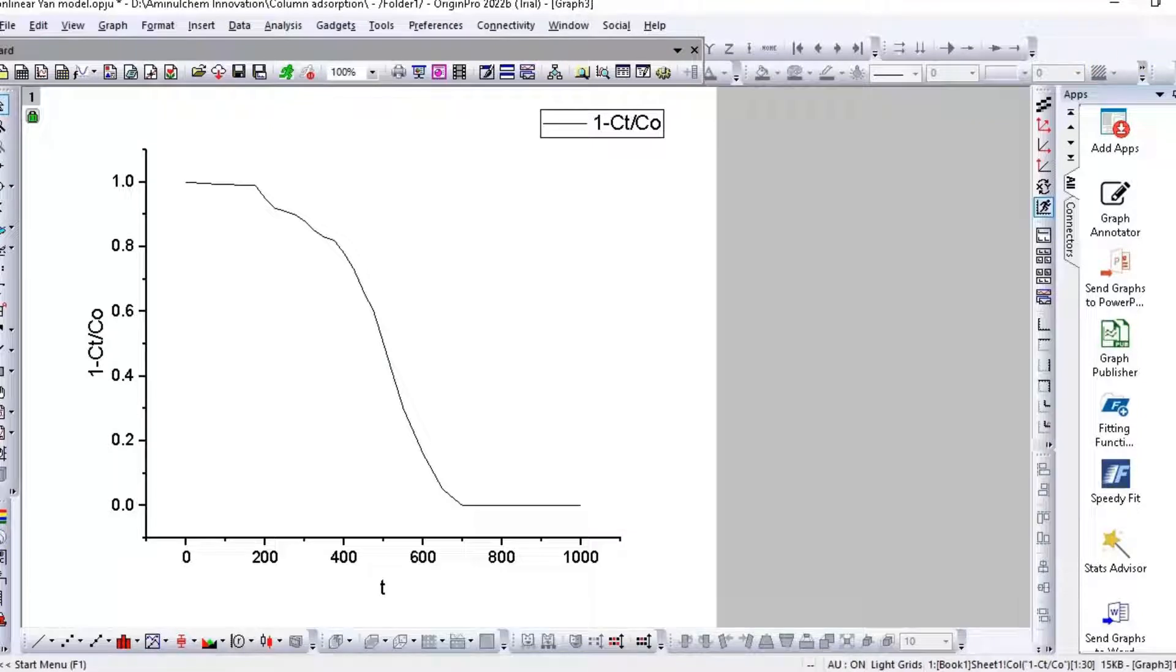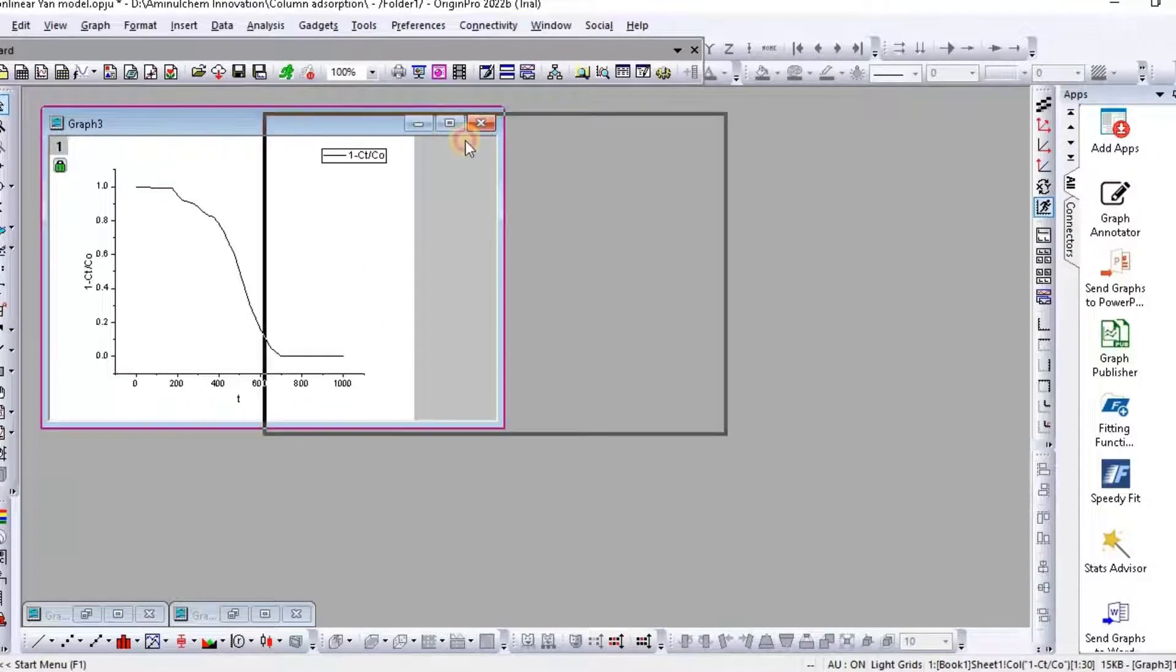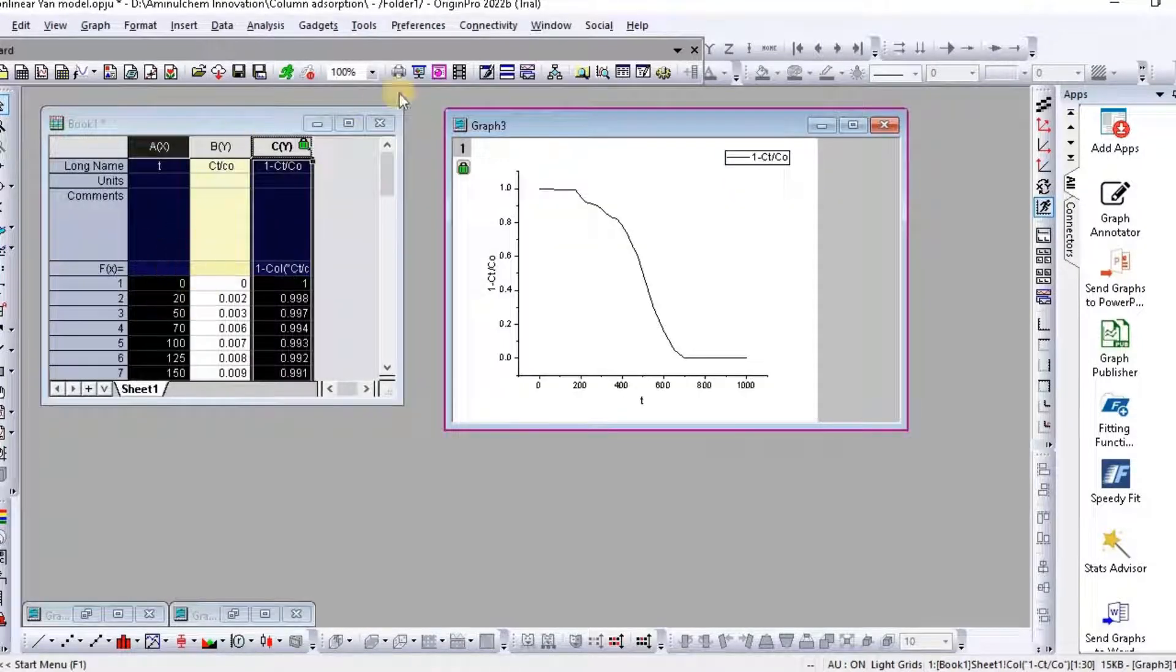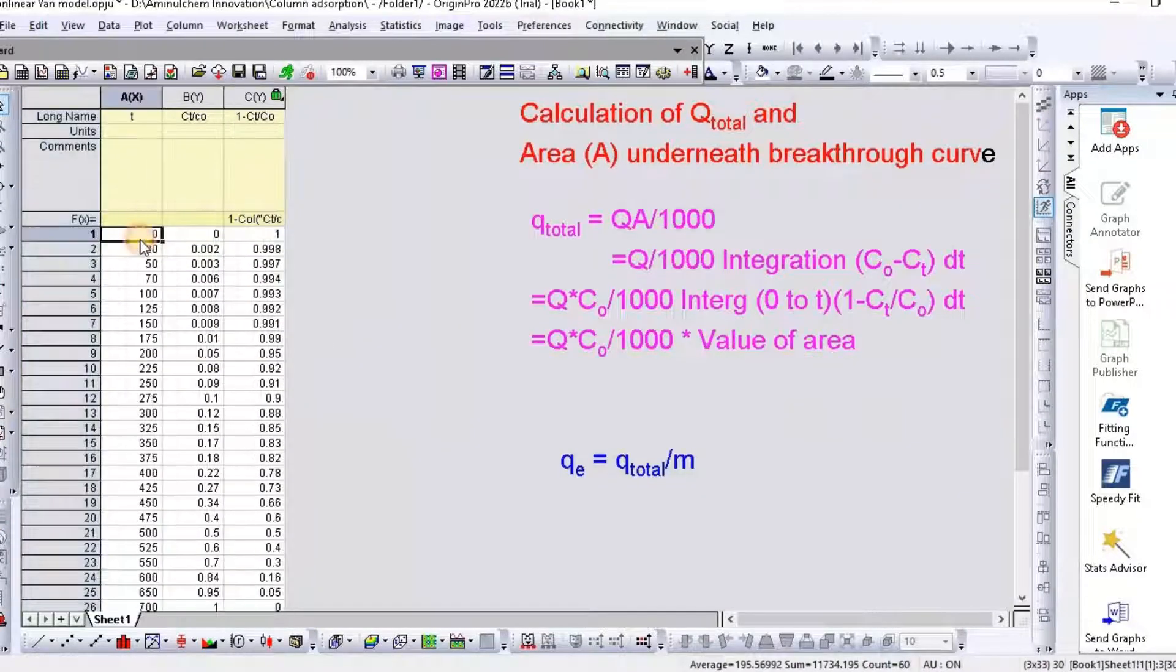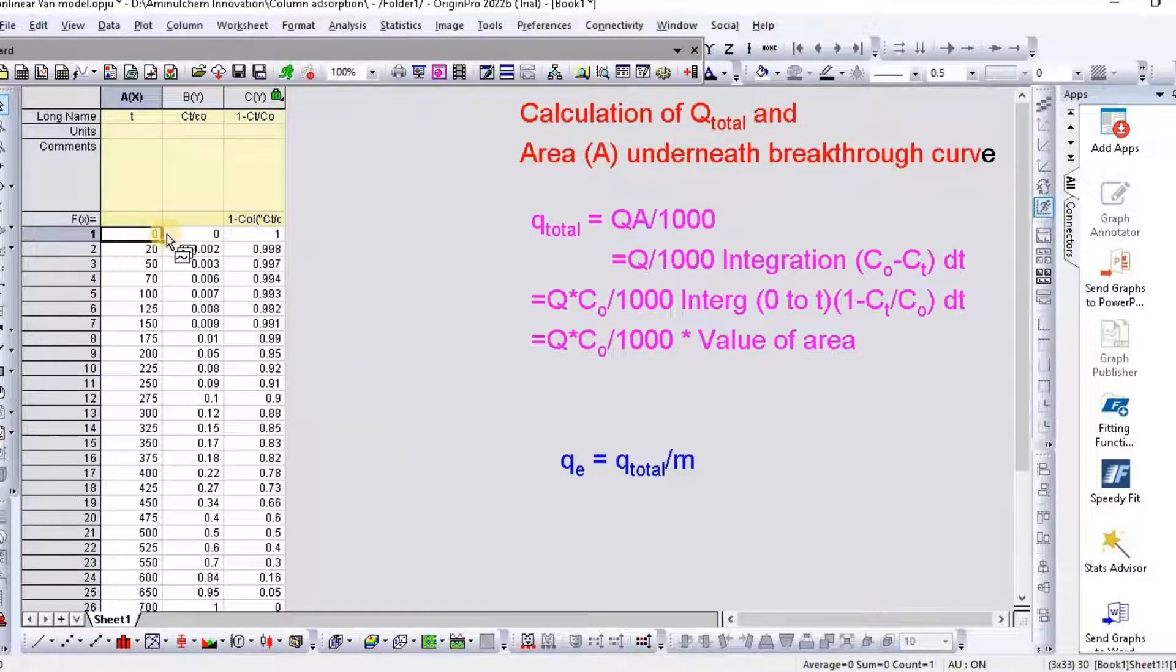And before this curve, you need to remember that your data point should start with T value 0 and Ct by C0 value 0.